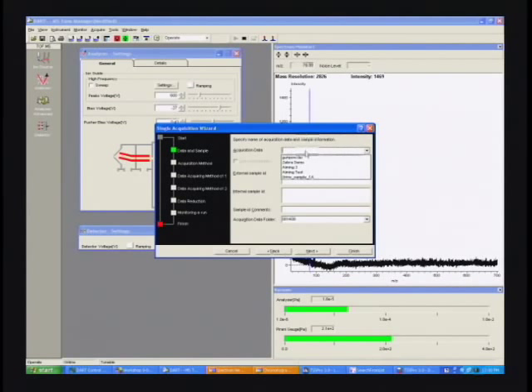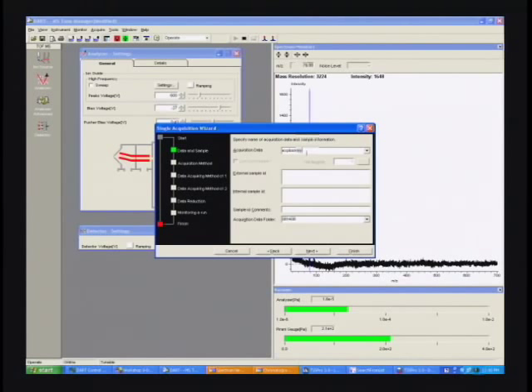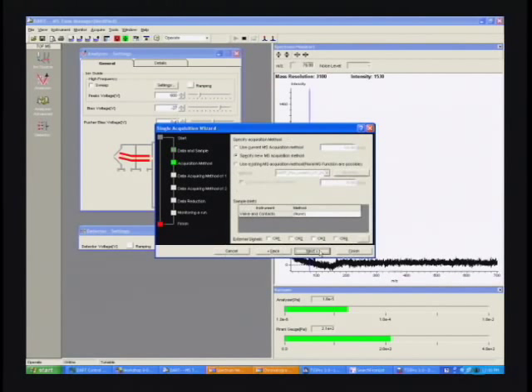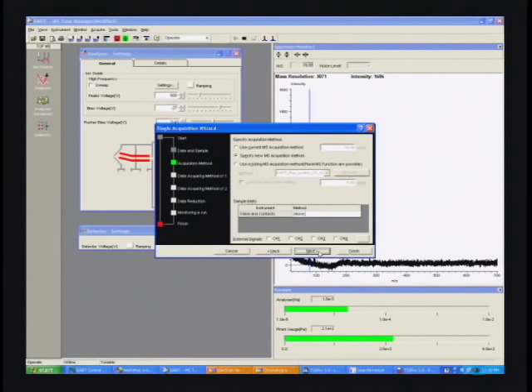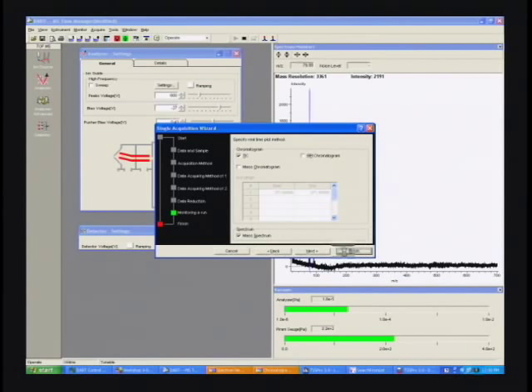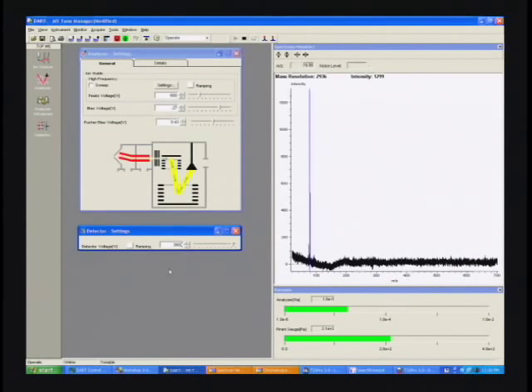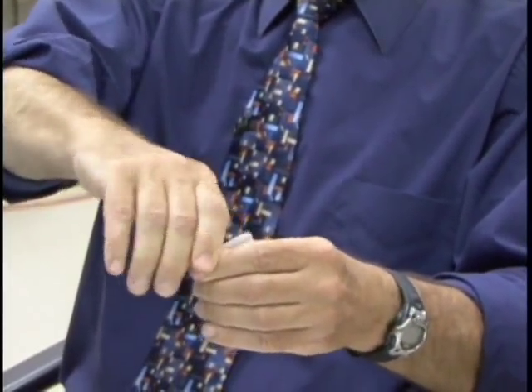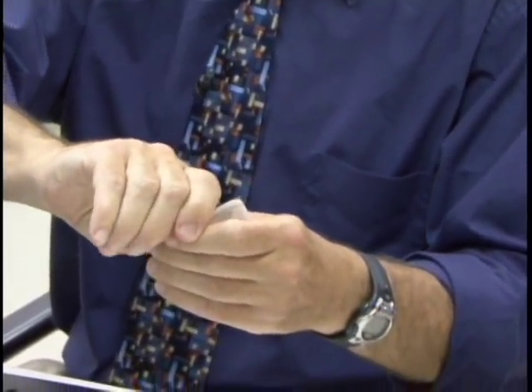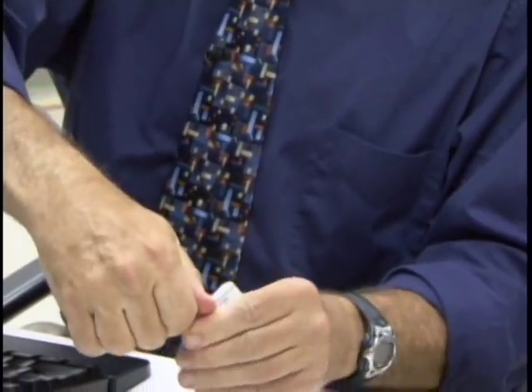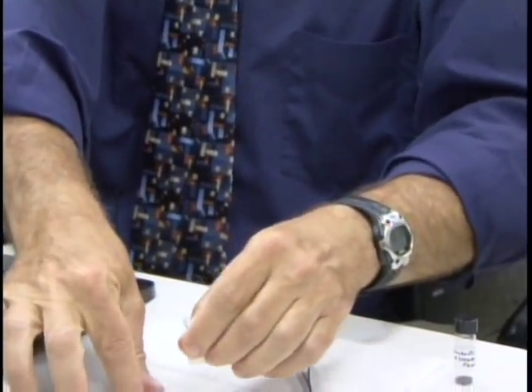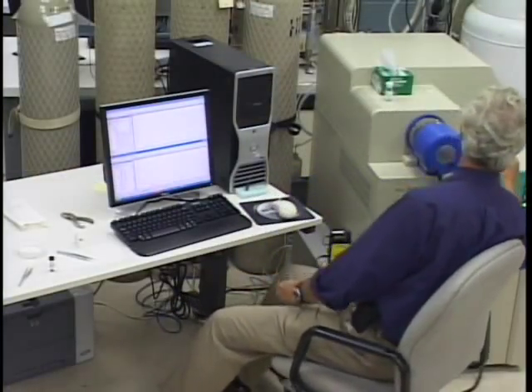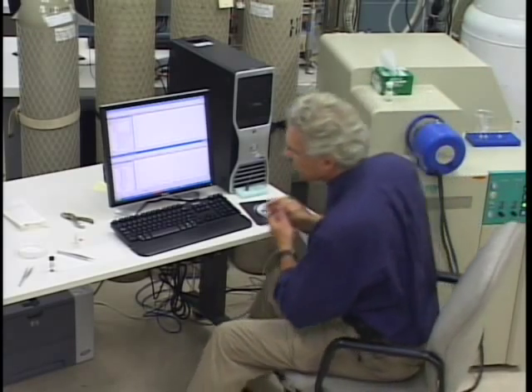Let's just call this explosives. This is a mixture of TNT and high explosives like RDX and HMX and a few other things. They're a dilute solution. We'll go ahead and run that. I'm just going to open the vial here and dip a melting point tube in it. That's just because it's a standard liquid solution of explosives. Particles or wipes or cloth could be handled the same way. Let's grab a melting point tube.